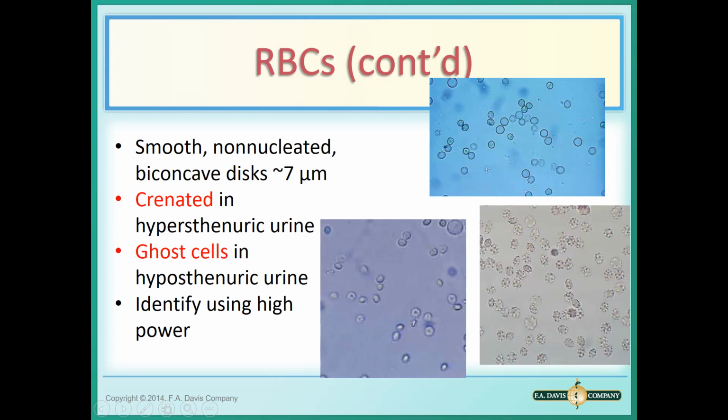They can be laying on their side. Remember, red blood cells are 3-dimensional, and so if they have a little bit of an odd twist or turn to them, it's because they're rolling around in a fluid. So imagine you have a beach ball in the pool and you throw it in. It rolls and twists and turns. The same thing happens to red blood cells. So be aware that you don't always get a picture-perfect one like this. You might get one that turns a little on its side. But these are the crenated ones, the ones with the little spikes on them.